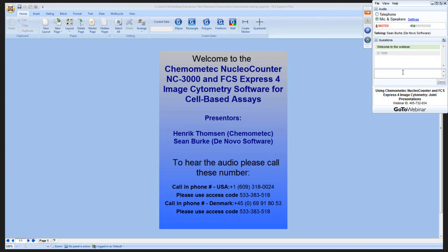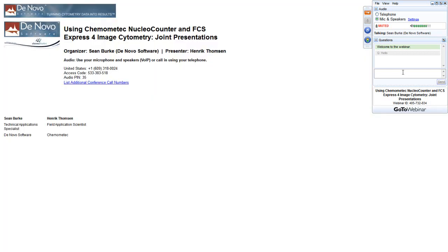But with that all said, I'd like to hand the webinar over to Henrik now, and let me make you the presenter, and maybe you could introduce us a little more about the NucleoCounter 3000 and show us how it works. Yes, thank you very much, and I now put on my screen for all of you to see.